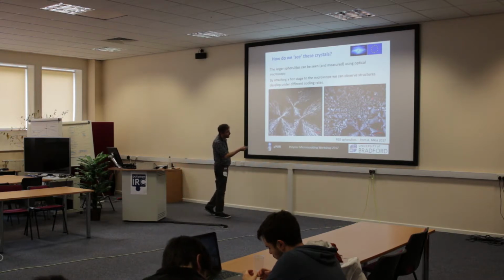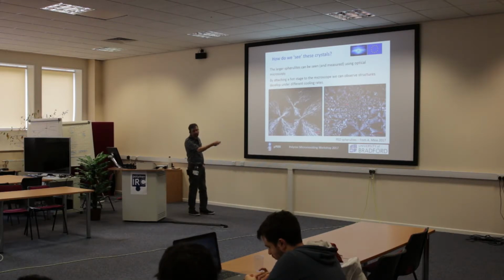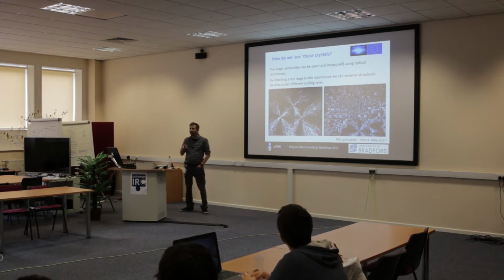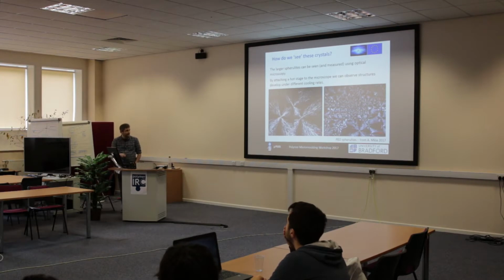Looking at a slightly different cooling rate, you can see we're now getting a range of different crystal sizes within this material. So each spherulite, again, has these nucleation points. You've got big ones down here, very, very small ones in there. So you're not going to get one size of crystal, you're going to get a whole range of size of crystals.